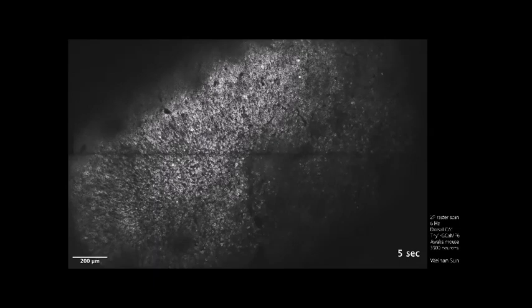So already yesterday in the workshop, we talked a lot about calcium imaging, as well as a little bit about somatic voltage imaging. And those are both great ways to measure the output of neurons, basically spikes. So for example, this is calcium imaging of neurons in the hippocampus and CA1. A lot of these are place cells, meaning that they fire when this mouse is in a particular place in its environment.